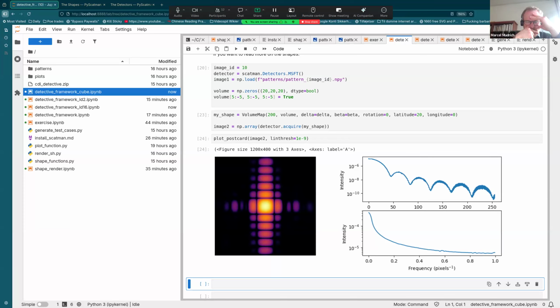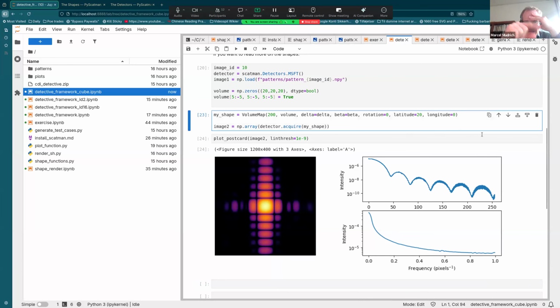But in general, these very elongated, prominent streaks always come when you have at least two surfaces being parallel to one another along the beam direction. Whenever you get this slit effect, you get these very strong streak patterns.